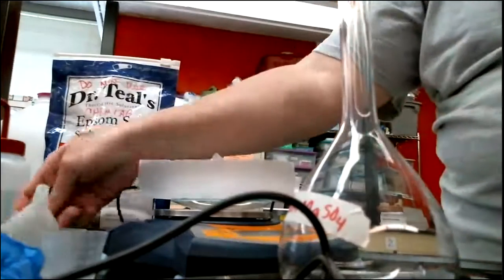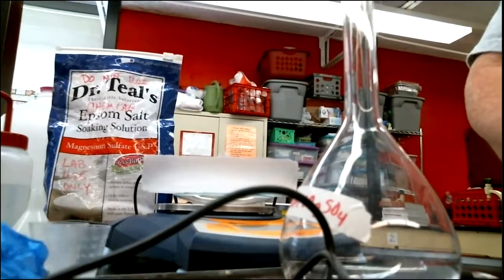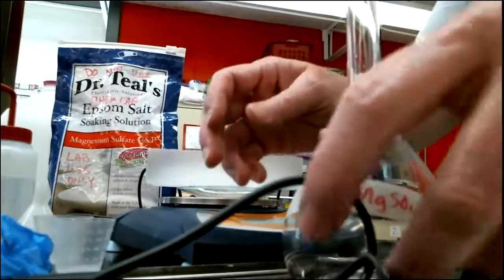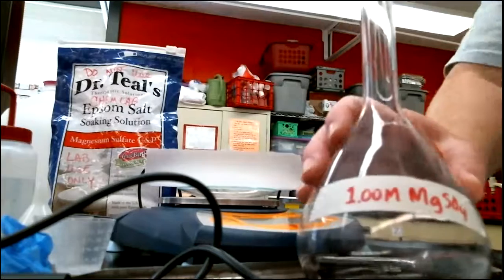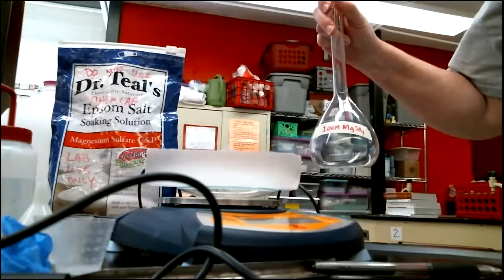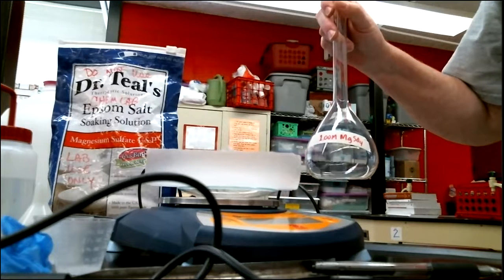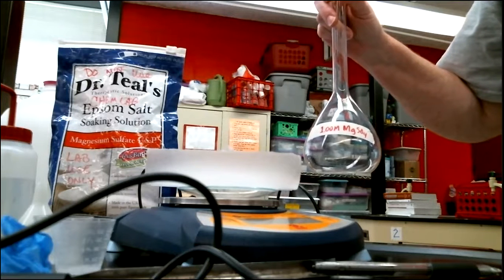Okay, so we're going to do this and measure out the amount that we'll need to make a 1 molar solution. All right, so I need to ask you something. We said that a 1 molar solution would be 1 mole of solute per liter of solution. Well, my flask is not a full liter. My flask is 500 milliliters. So if I have a 500 milliliter flask, then that's only half as much as 1 mole per liter.